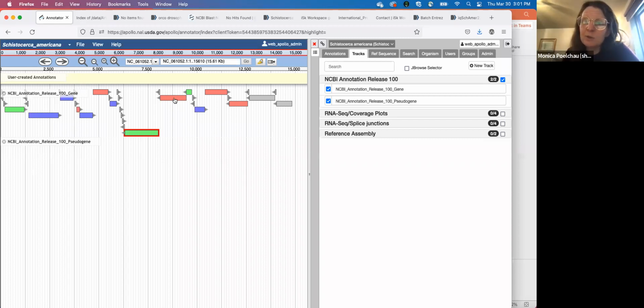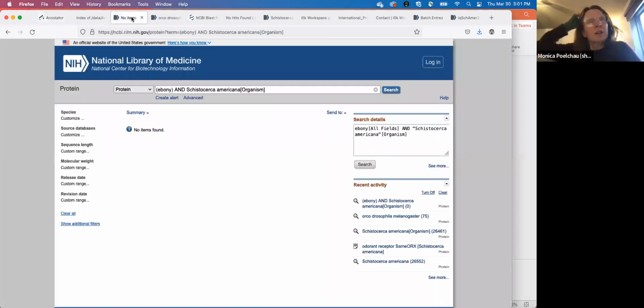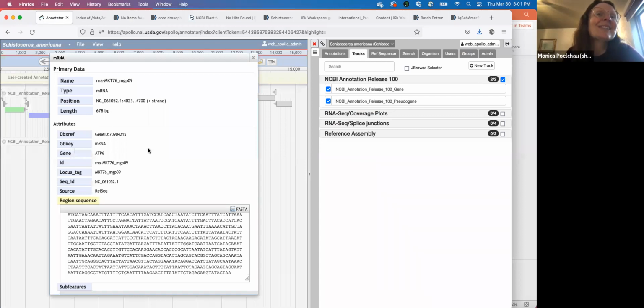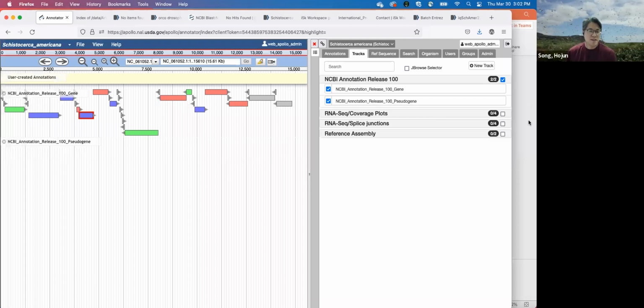You could try the NCBI name search, but the best way to find out if they actually gave these proteins names, other than looking here and seeing that they didn't, is to use a BLAST-based approach at NCBI or with us and see what's in the search results. Okay, that could be a side project. Right, sounds good.